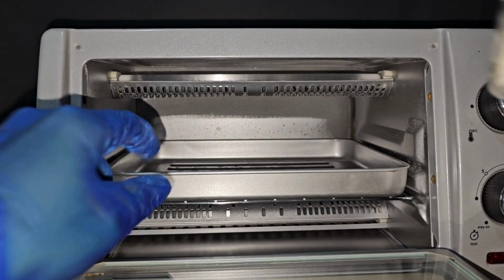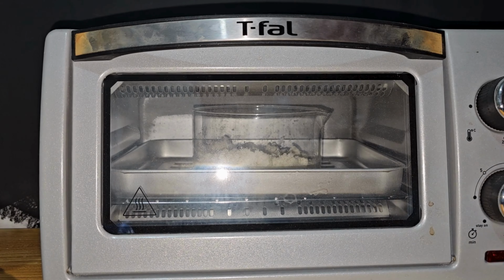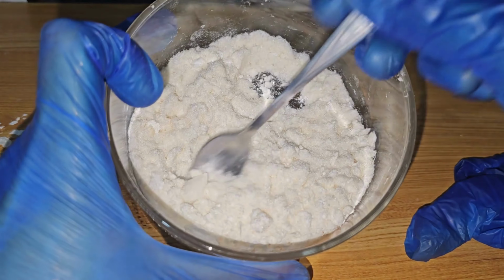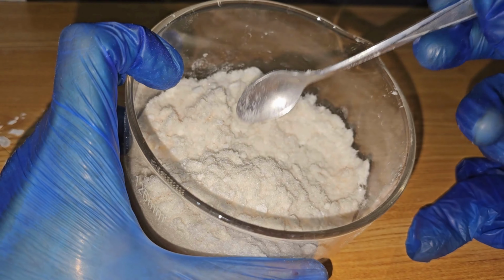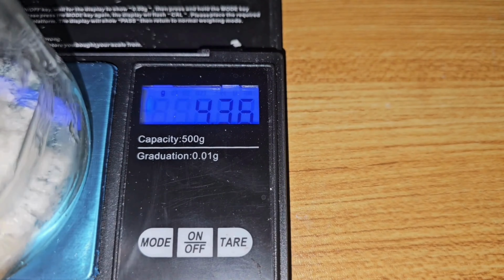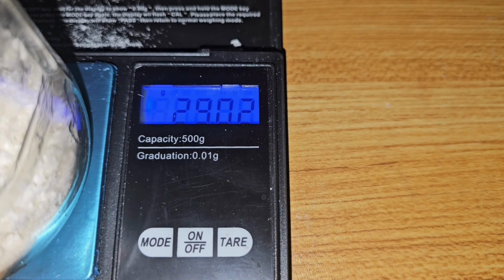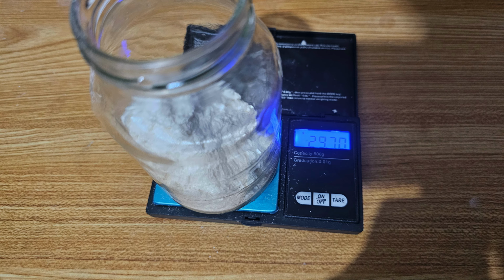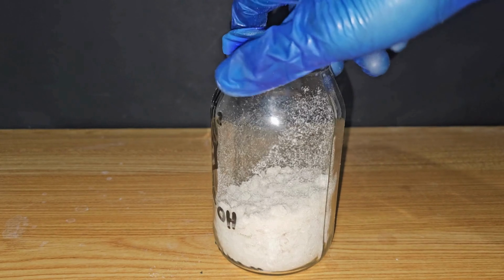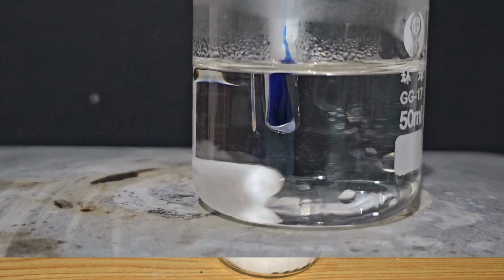I placed the recrystallization dish inside an oven and dried it for about 2 hours at 100°C. At the end I got this nice looking powder, but it still contains stearic acid. I weighed the resulting powder, and in total I got 29.7 grams of not the purest PABA in the world. This corresponds to a yield of 74.29%, but considering the purity, it should be between 65 and 70%.